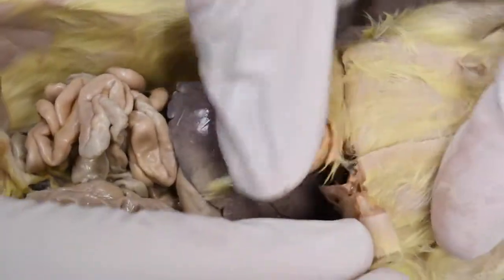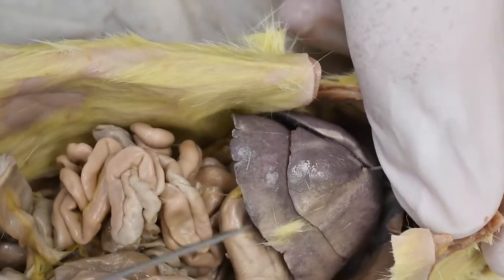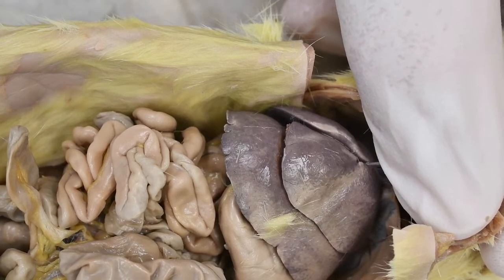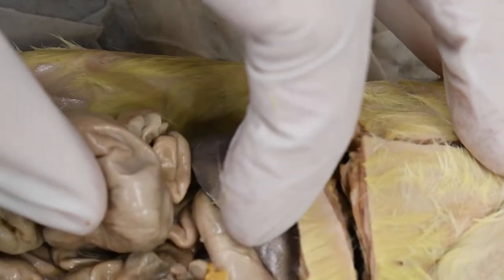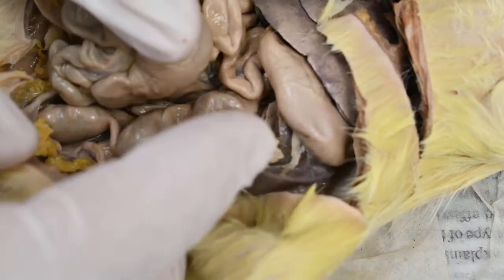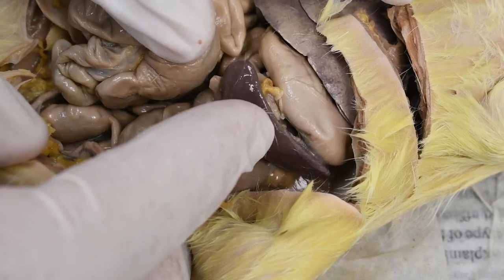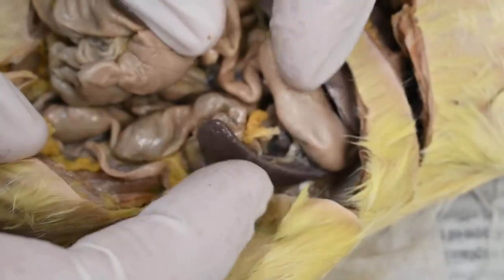Now I'm going to leave the digestive tract for last, but we'll take a look at a few of the other parts of the internal anatomy. So this large organ here is the liver, again, the largest organ in a mammal. Now most of this, okay, we'll go ahead and mention that's the stomach there. Here you can see the spleen. Notice the spleen sort of hangs off by a little ligament called the gastrosplenic ligament. It's part of the mesenteries, and it's on the greater curvature of the stomach.